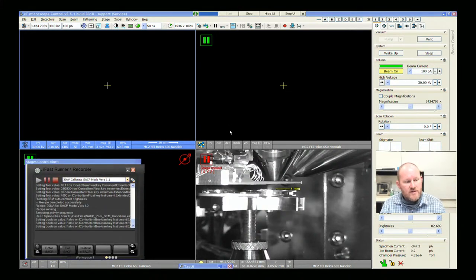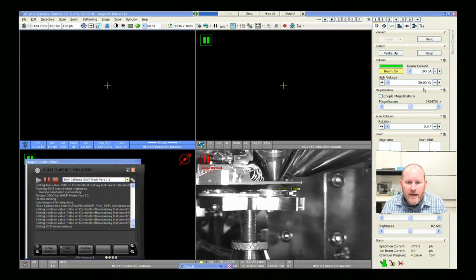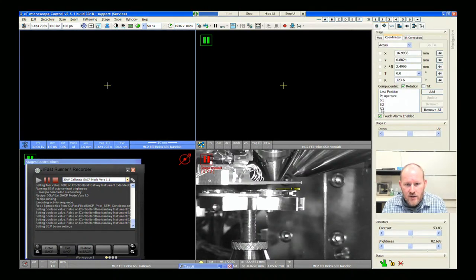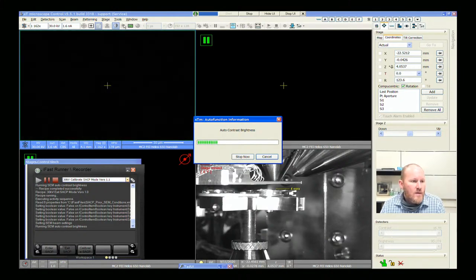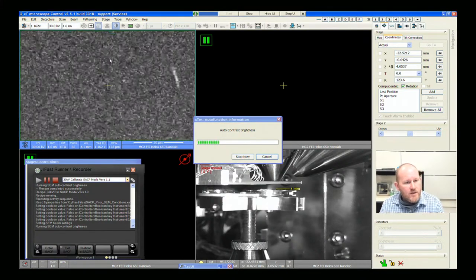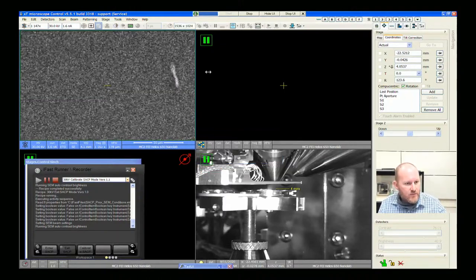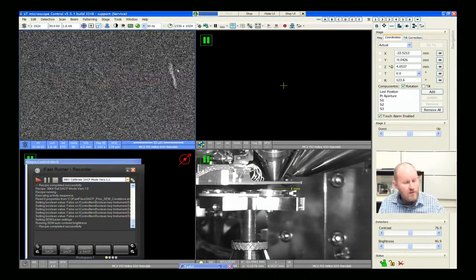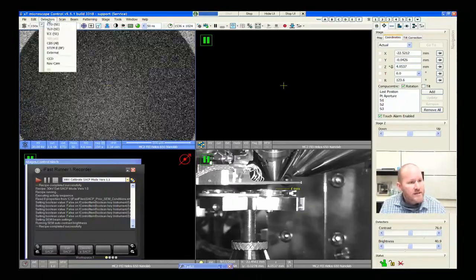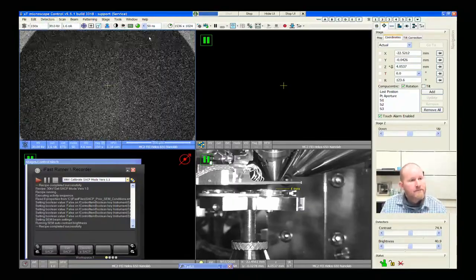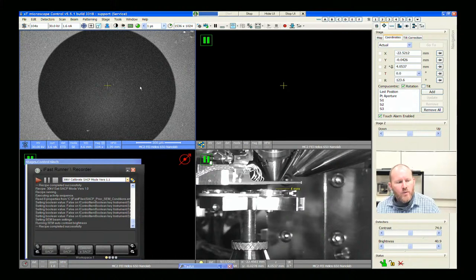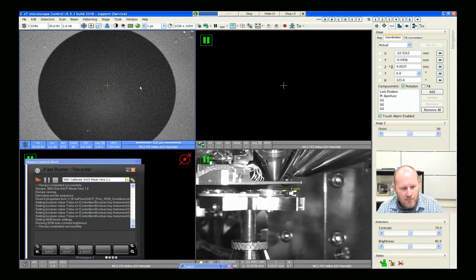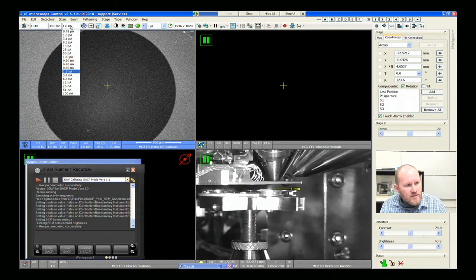I'm going to exit SACP mode and go back to the silicon — I believe number three was the better wafer. I have to admit that my storage of these samples has not been perfect — they've just kind of been in a plastic sample case. Now what we're going to do is build these SACPs from scratch.